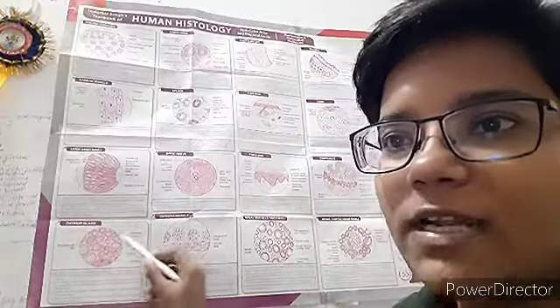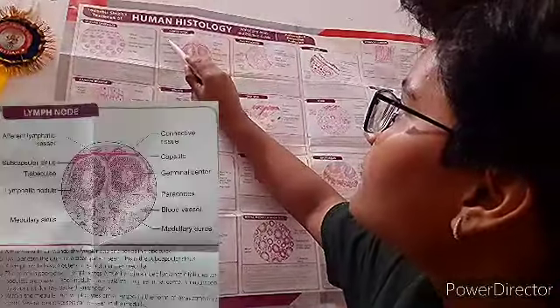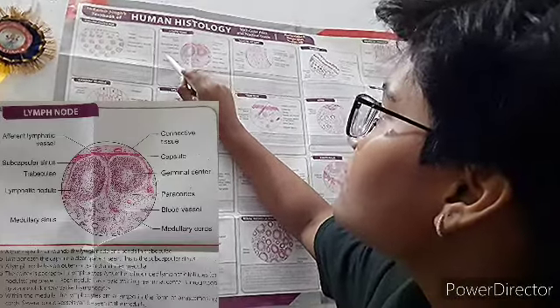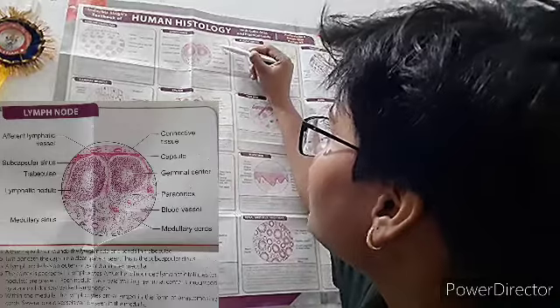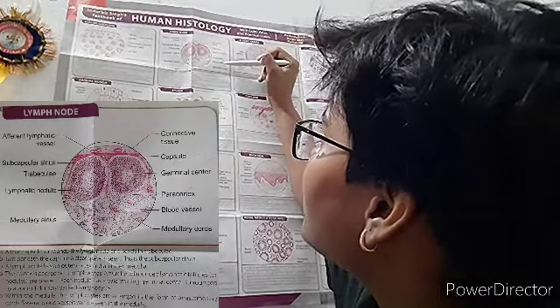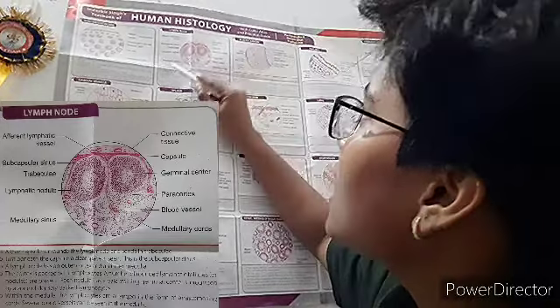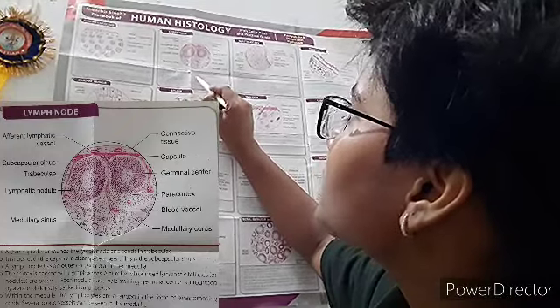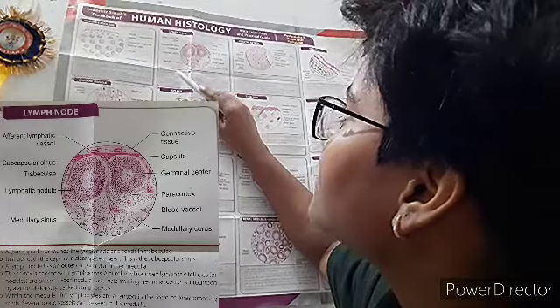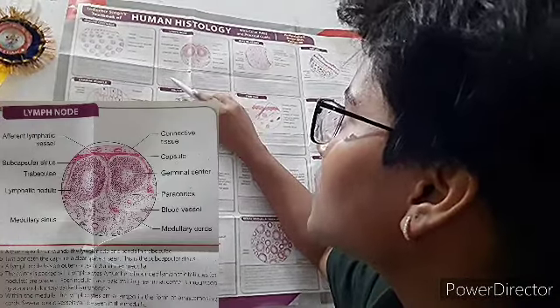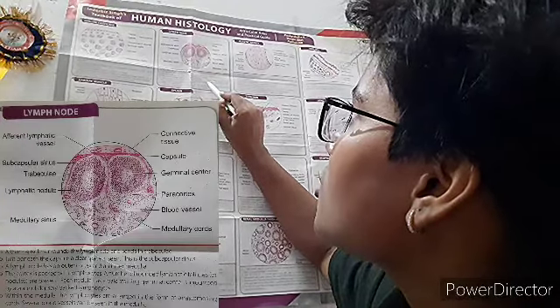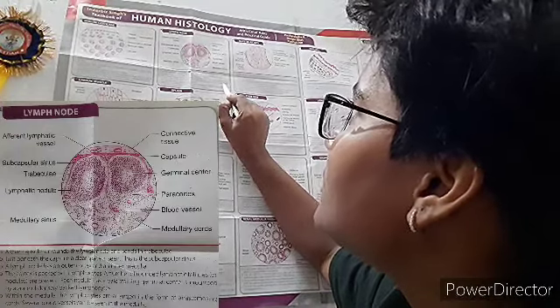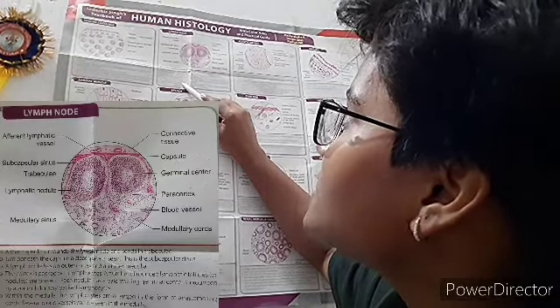Now the lymph node. Visible structures include afferent lymphatic vessels, subcapsular sinus, trabeculae, lymphatic nodules, medullary sinus, connective tissue capsule, germinal center, paracortex, blood vessels, and medullary cords. A thin capsule surrounds the lymph node and sends in trabeculae. Just beneath the capsule, a clear space — the subcapsular sinus — is seen. The lymph node has an outer cortex packed with lymphocytes, and a number of rounded lymphatic follicles or nodules are present. Each nodule has a pale-staining germinal center surrounded by densely packed lymphocytes.